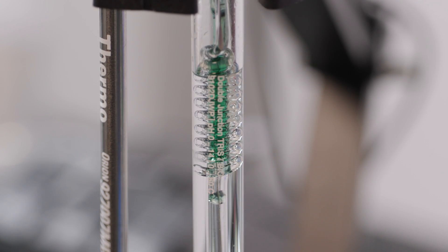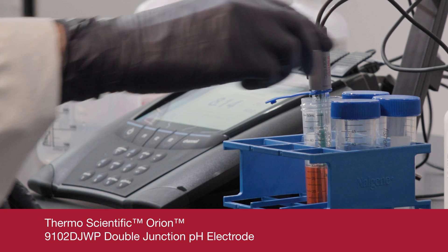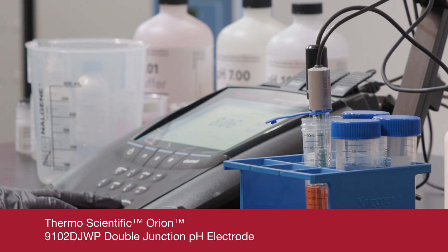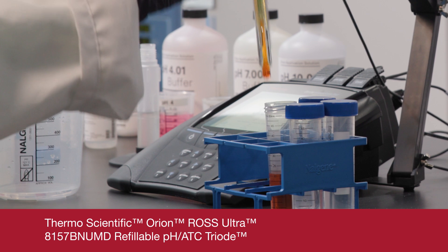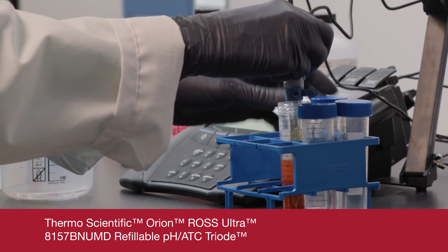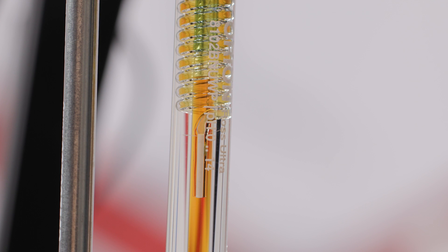To solve this issue, use a double junction reference system that doesn't allow contact between your samples and the silver ions, or simply use a reference system that contains no silver ions. The Thermo Scientific Orion Ross line of pH electrodes uses a non-silver double junction reference system that's suitable for samples of this type.